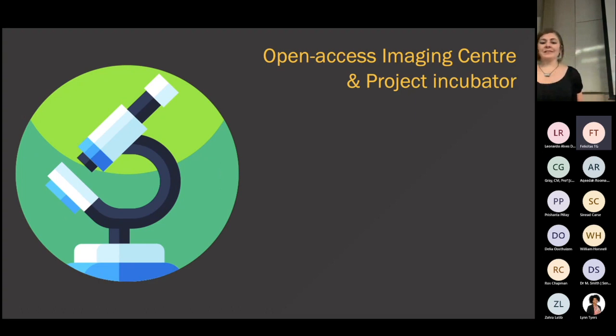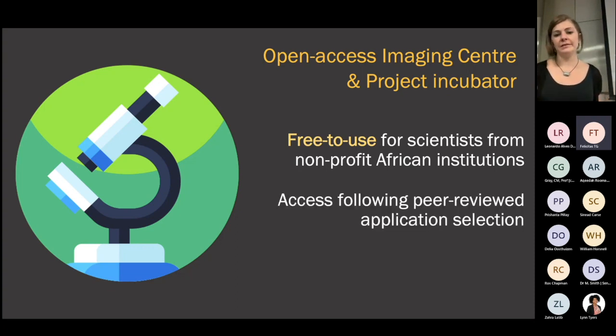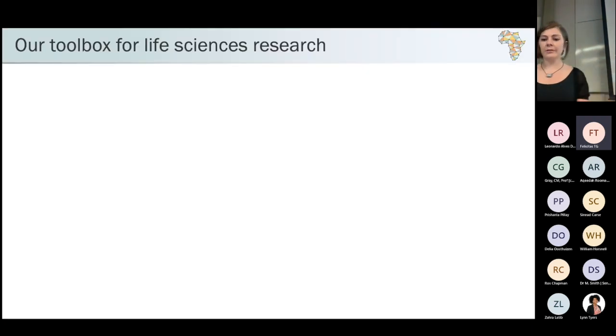So the Open Access Imaging Center, we also call it a project incubator. The key take-home message is that this is really free to use for any scientists doing non-profit research in Africa. I will go more into that. So access for anyone, and I'll touch on this again, whether you're coming from down the corridor or across the continent, will be through a peer-reviewed application process. And what we're excited about is that with the systems we have here, we can incubate high potential projects to give them a springboard to other facilities across the world with more advanced systems than what we have.